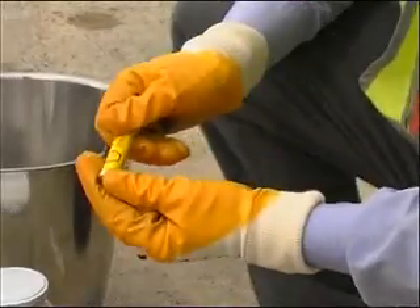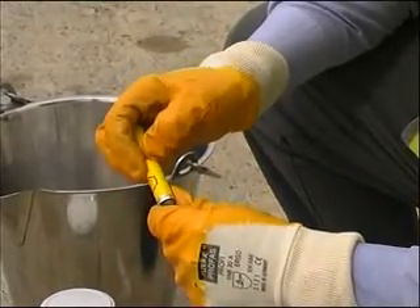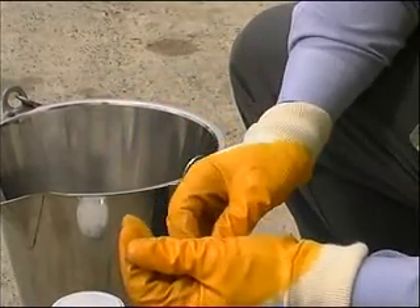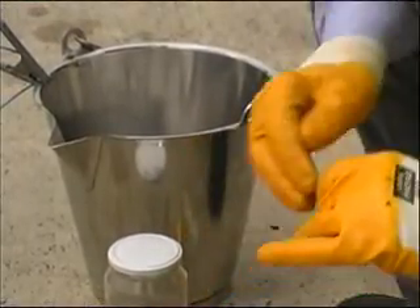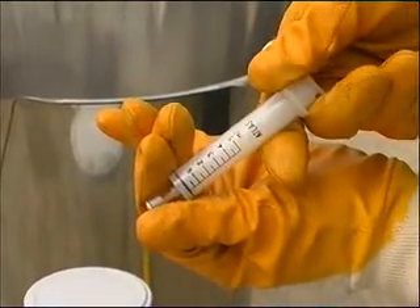Step 2: Fit the capsule. Remove a capsule from the tube. Handle carefully and do not touch or allow any moisture onto the yellow paper of the capsule. Close the tube to avoid contamination of other capsules by ambient humidity. Fit the capsule to the syringe with the plunger in the depressed position.